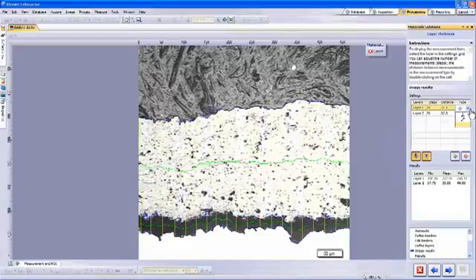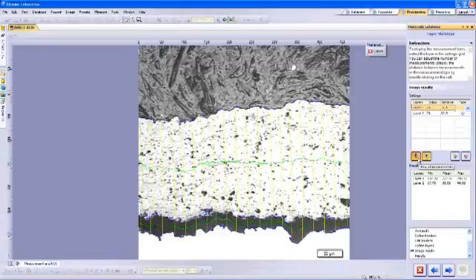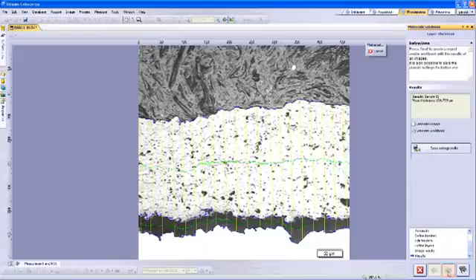If we were to use the Close Layer option, we would have another selection here for displaying the measurement lines to lie in a radially symmetrical pattern. If we leave the Display All Measurements selected here, it will carry over into our report. Click Next to move on to Results.